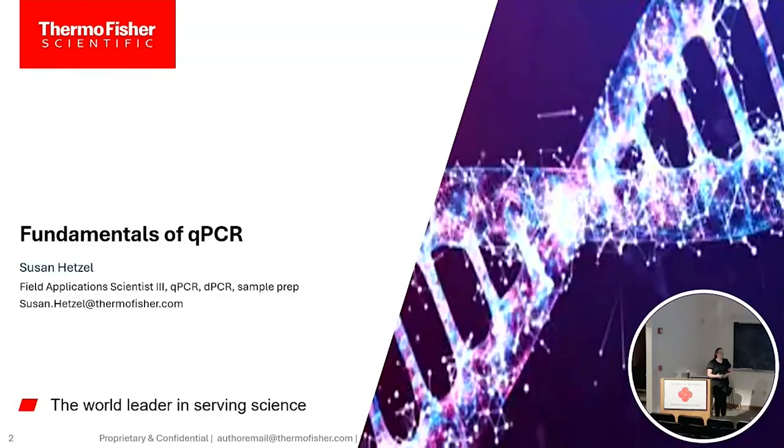because it's really, I fell into this trap too. I love instrumentation. It was always the thing that I got the most excited about. I got to learn the new thing and use the new tool, but it's not necessarily the best for everything. So always picking the right tool for the application. So that's going to be the focus there.